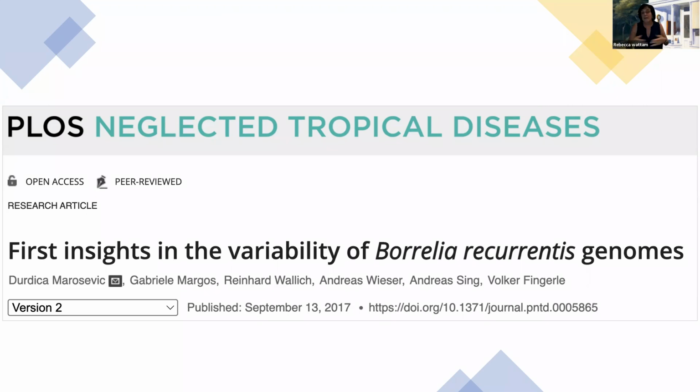Well, you're right. For the SNP analysis that I'm doing today, there are two requirements. Genome, which is easy to get, but also reads. This particular pipeline that we have in BV-BRC uses reads against a reference genome.